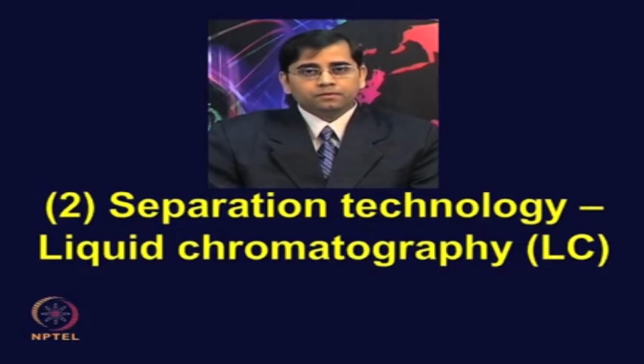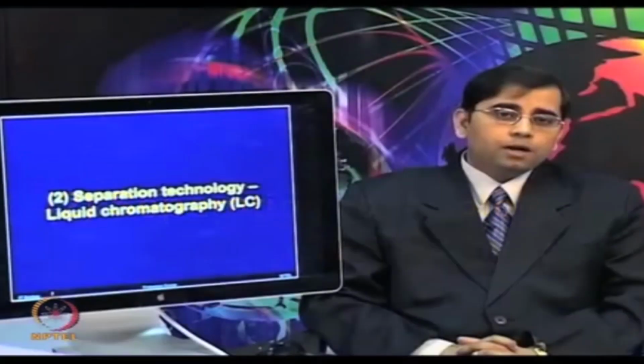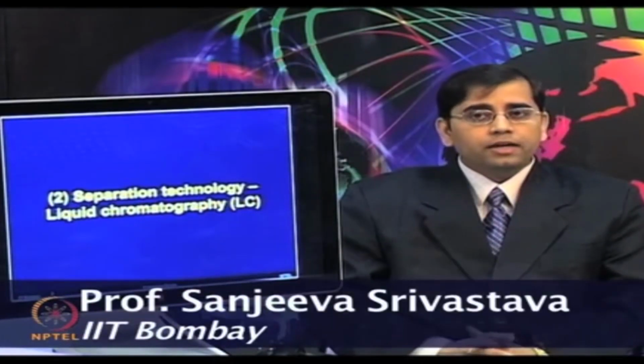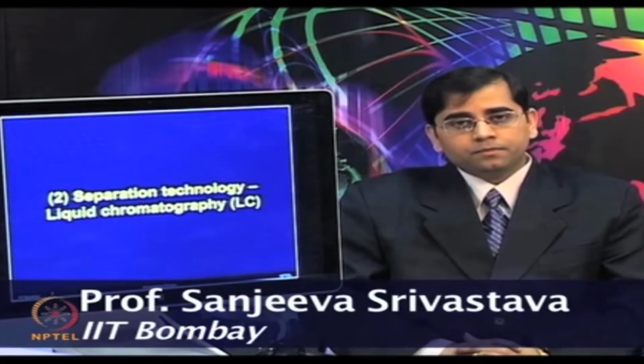LC. So, chromatography in general is a physical separation method in which components for separation are selectively distributed in two immiscible phases, a mobile phase flowing through the stationary phase.